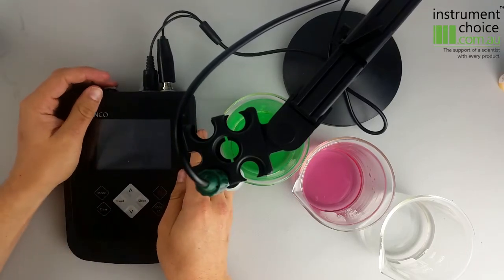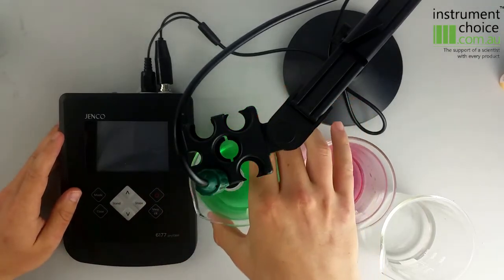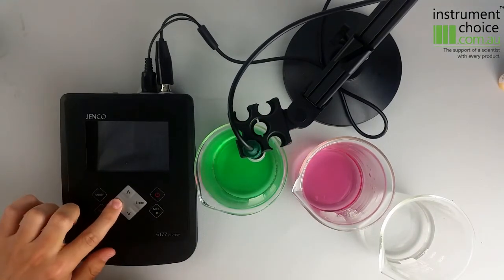What we'll do is run through a quick calibration just so you can see how simple and easy the instrument is to use. The first calibration you want to do is at pH 7, which is the green one that we have here, so we'll put that into the solution and hit the stand button.